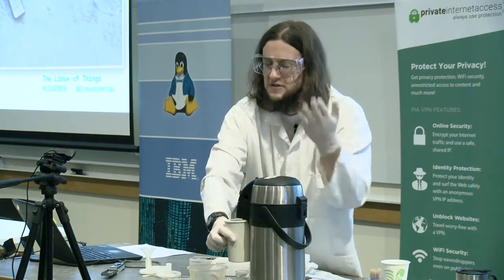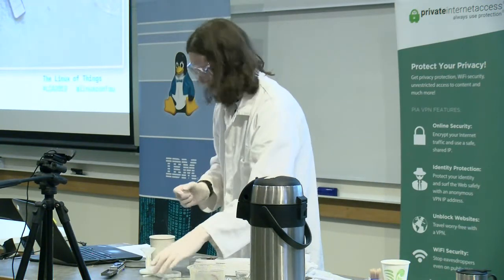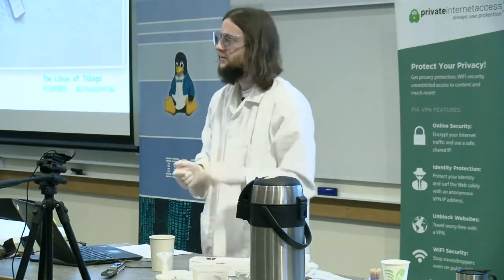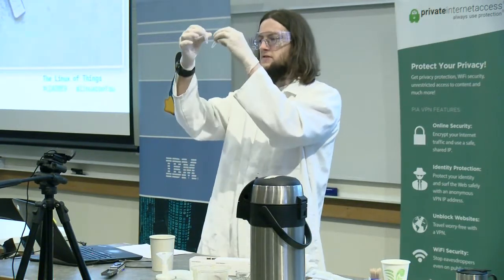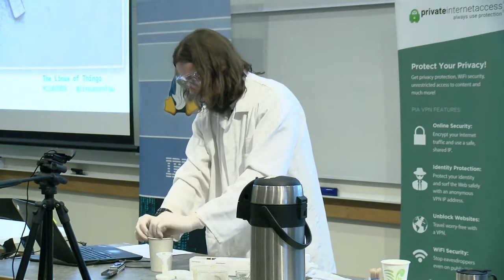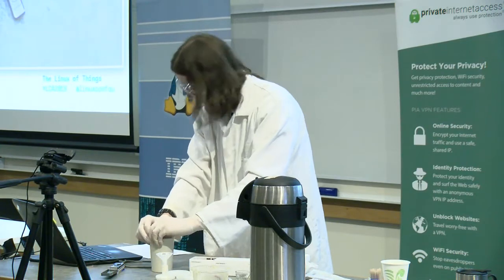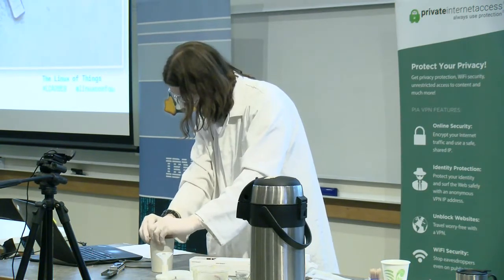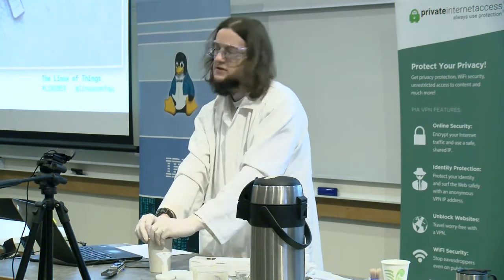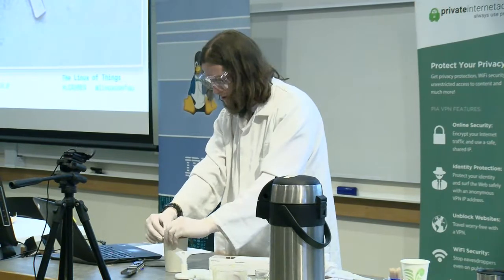I'm hoping that this is about 80 degrees. The purpose of this is to kill the munchy things that I added in a few minutes ago. Now, they need to sit there for another minute. This is to make sure that the fragmentation enzymes are suitably dead and won't give me any funny business later on.